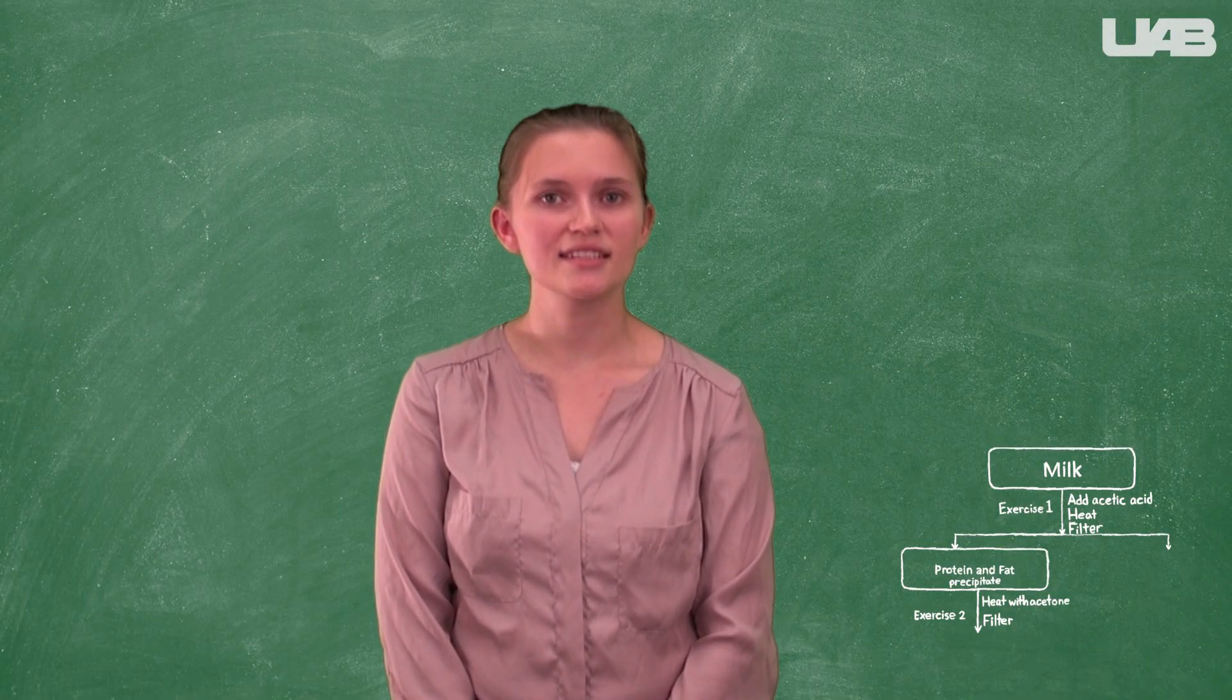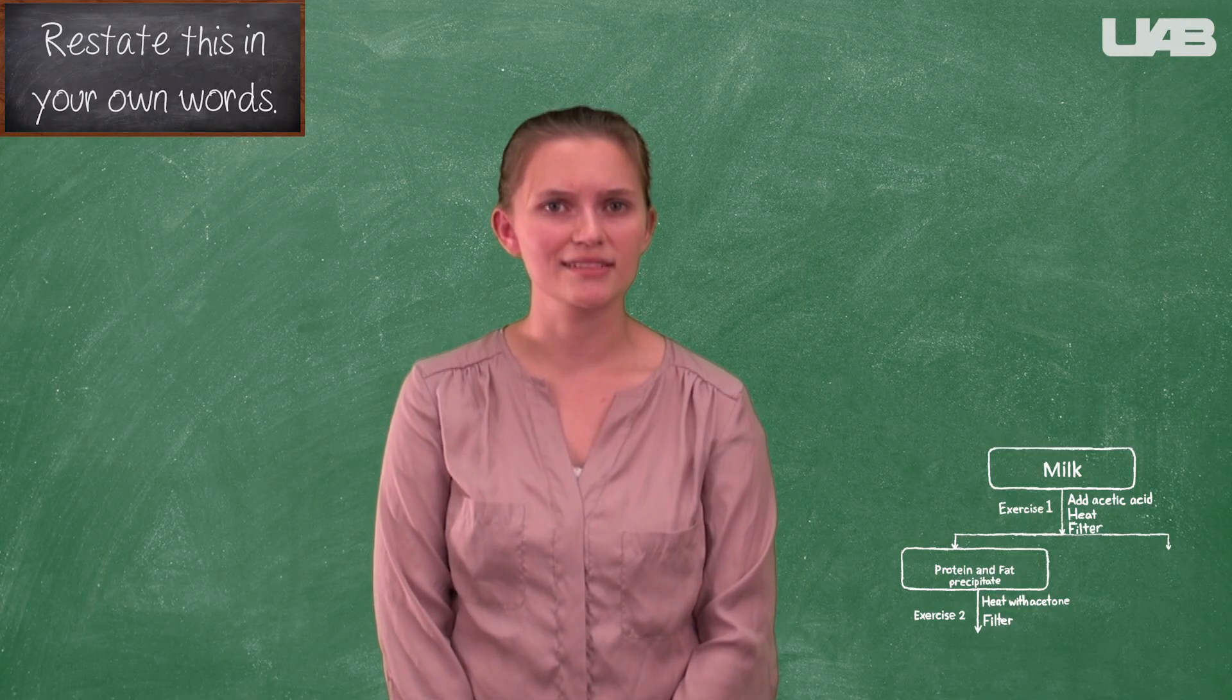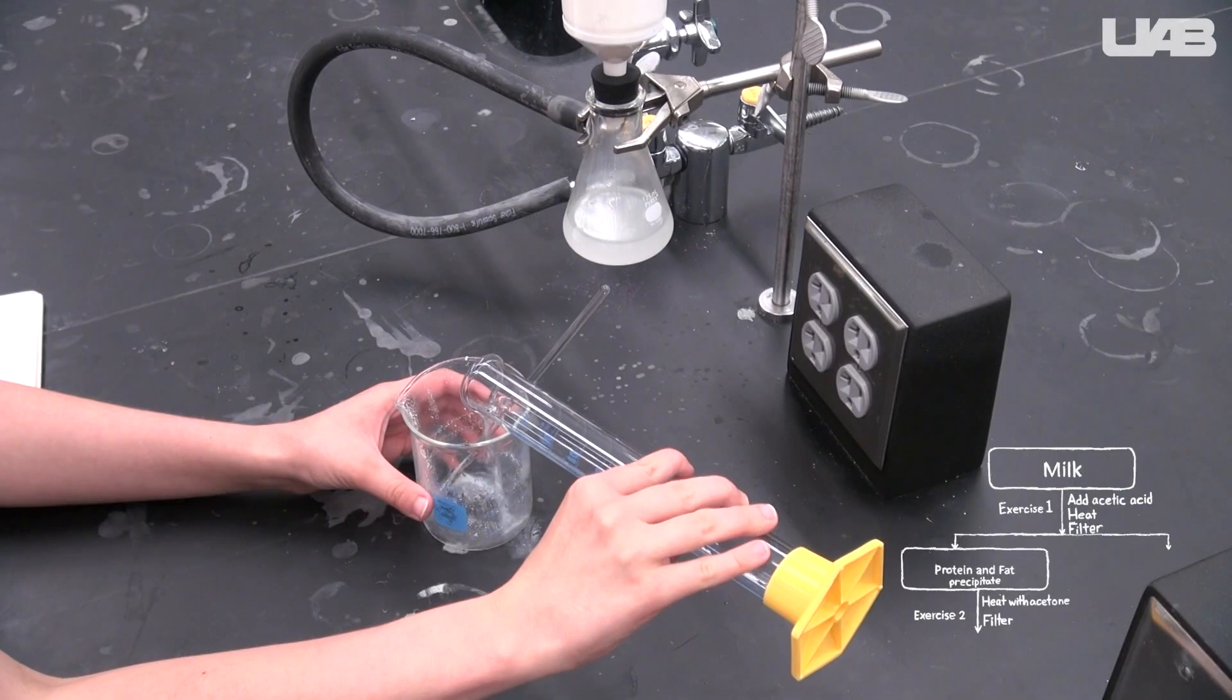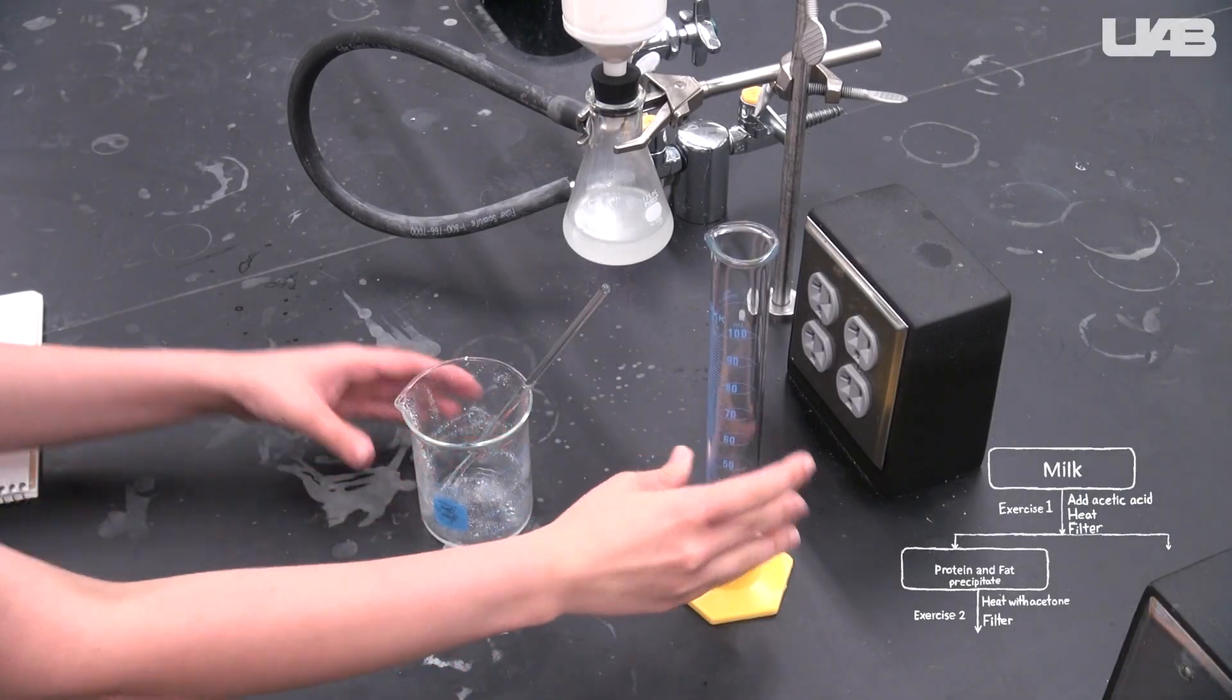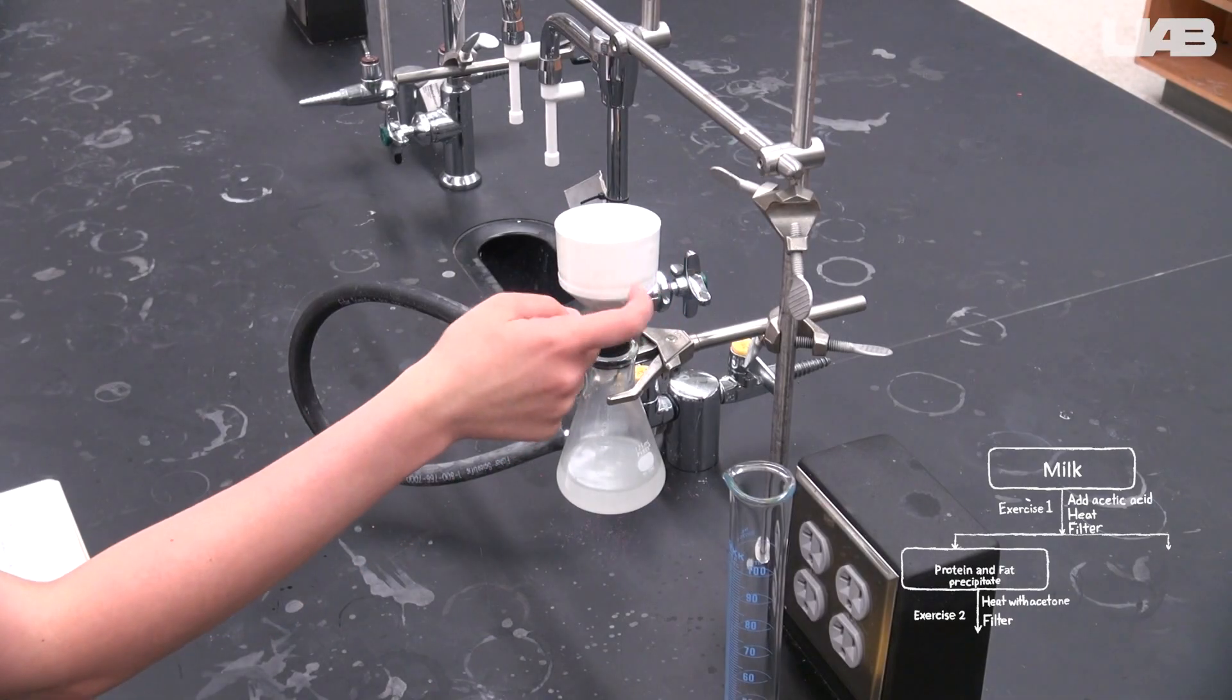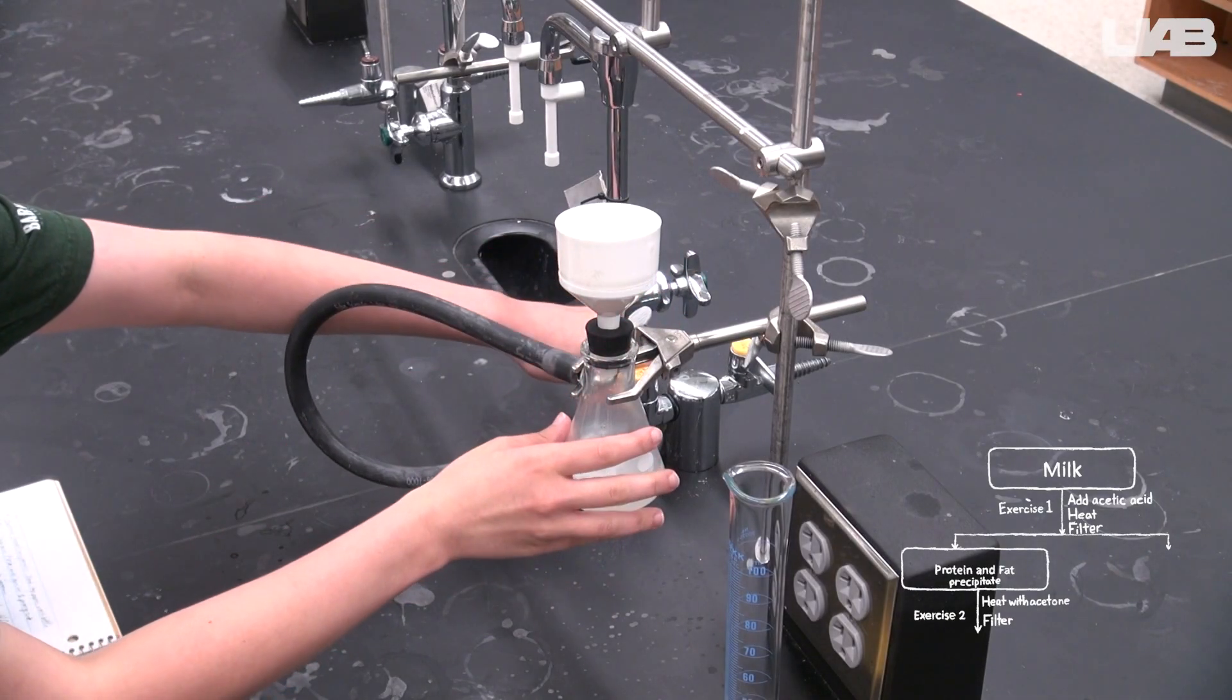Perform the washes indicated in the manual. You may need more than what is listed to fully wash away any impurities and to get all the solid out of the beaker and off of the stir rod. You should add the wash to the beaker that had the solid in it, then pour it in with the vacuum turned off. Pack the side of the funnel a couple of times and then turn the vacuum on.